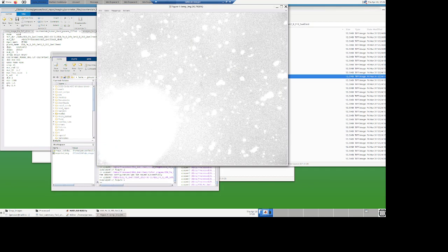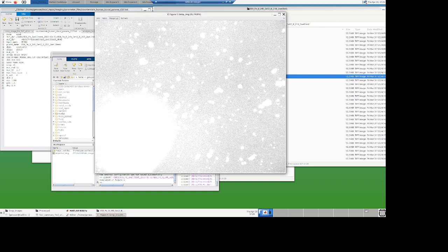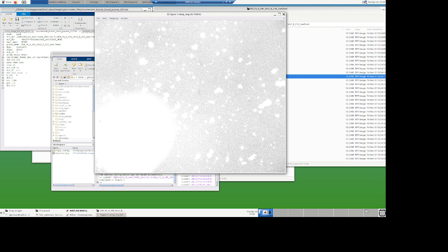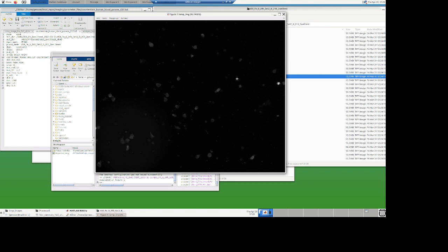It's reading this. That's really what's nice about the deeplib library, is that it has its own display system. On Python, it doesn't work this way. It's not as convenient. And you can do a linear stretch to see the images. You can see it's really uneven, by the way. You can see here there's something really funky about the imaging. There's a huge blob. That's interesting. Anyway, linear stretch means that it takes the dimmest spot in the image and turns it to black, and the brightest set to white. So something here is white, and something here is black.